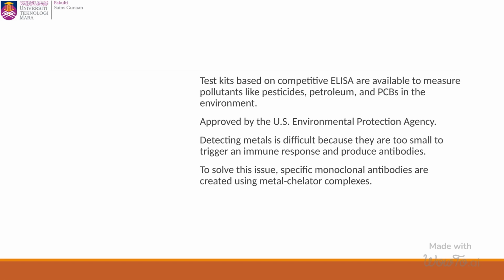Several groups have also worked on development of monoclonal antibodies for detection of various metals. Metal detection is problematic due to the small size of the metal atom, which does not elicit an immune response, and so antibodies are not produced. This problem has been overcome by using a metal chelator complex to produce specific monoclonal antibodies.